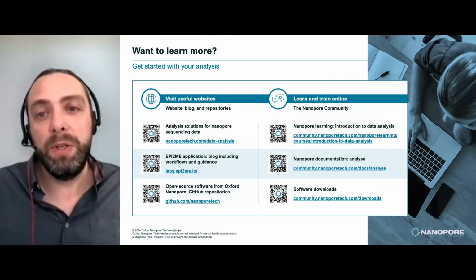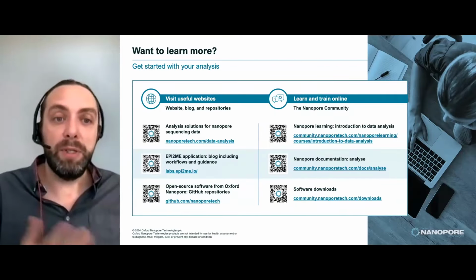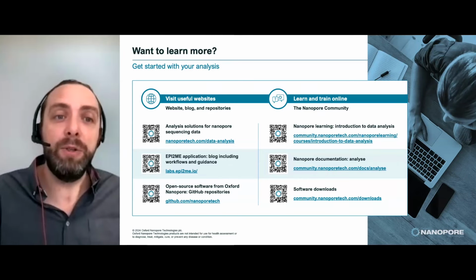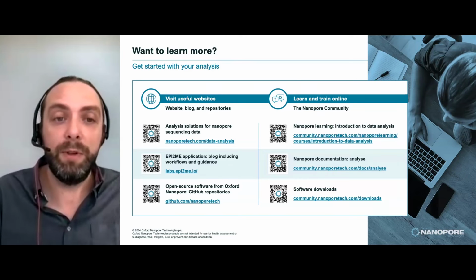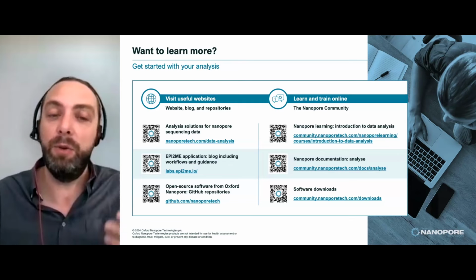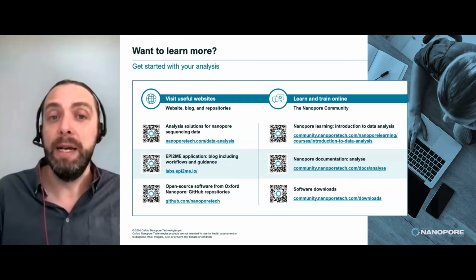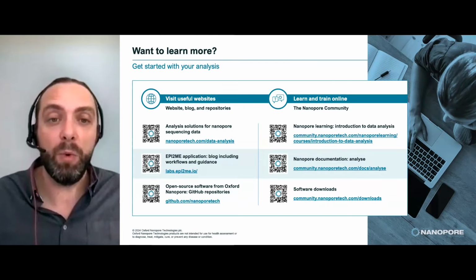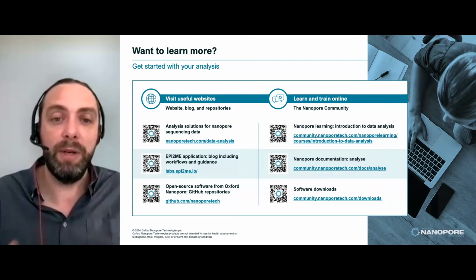So that brings us to the end of the presentation, but obviously this shouldn't be the end of your Nanopore journey. If you are interested in learning more, you can always follow any of these links. You can go to the Epi2me website, download data and start analyzing or start running our workflows, even if you haven't actually generated data yourself.